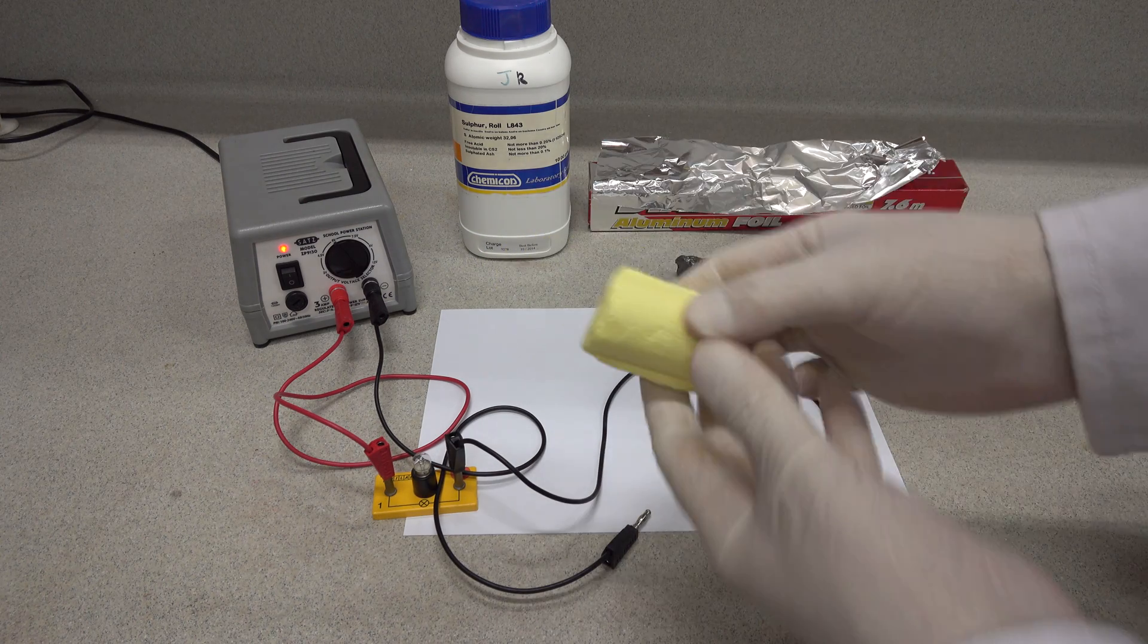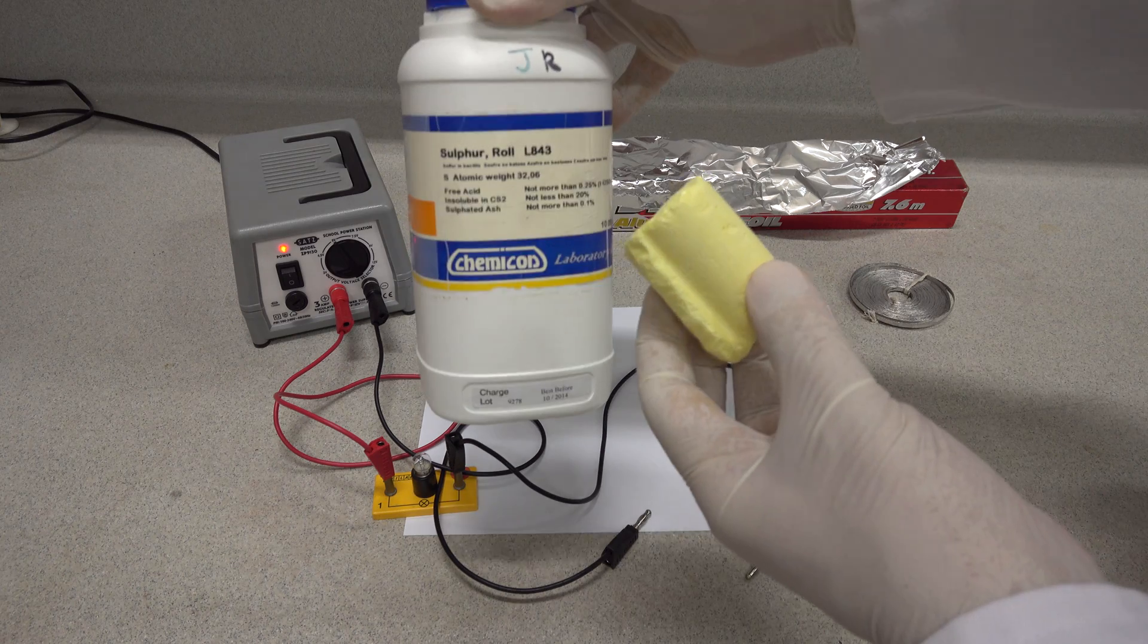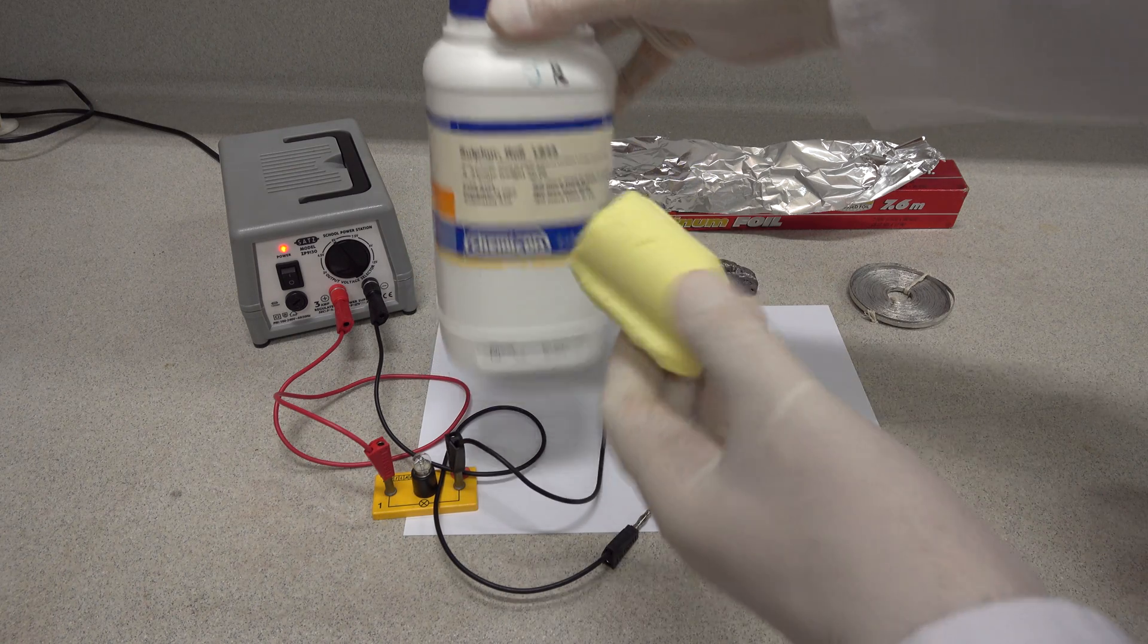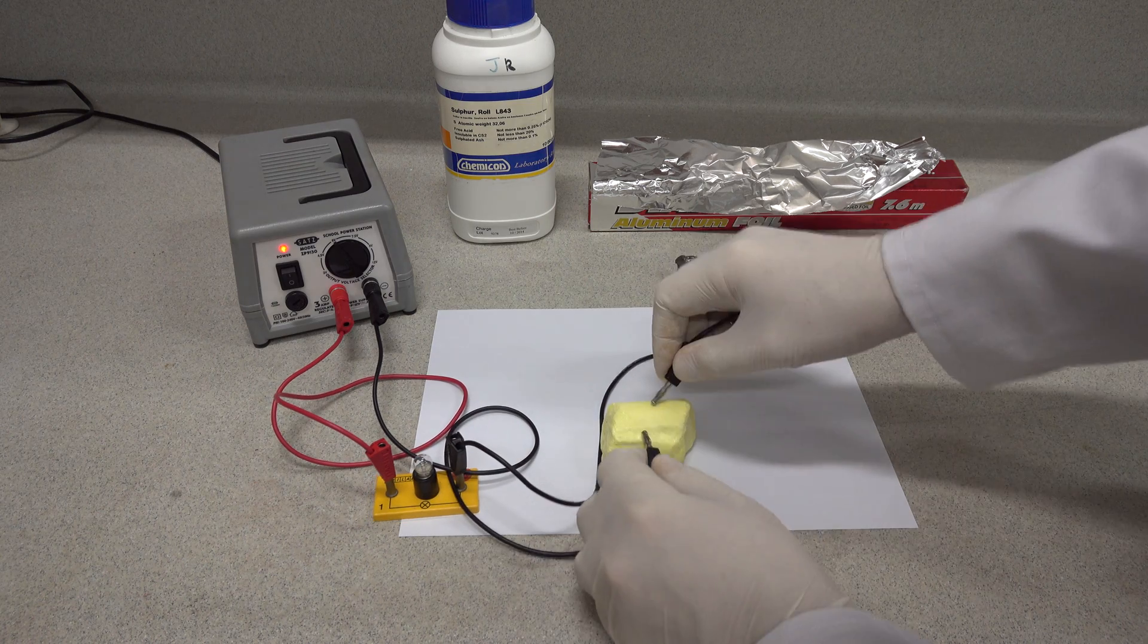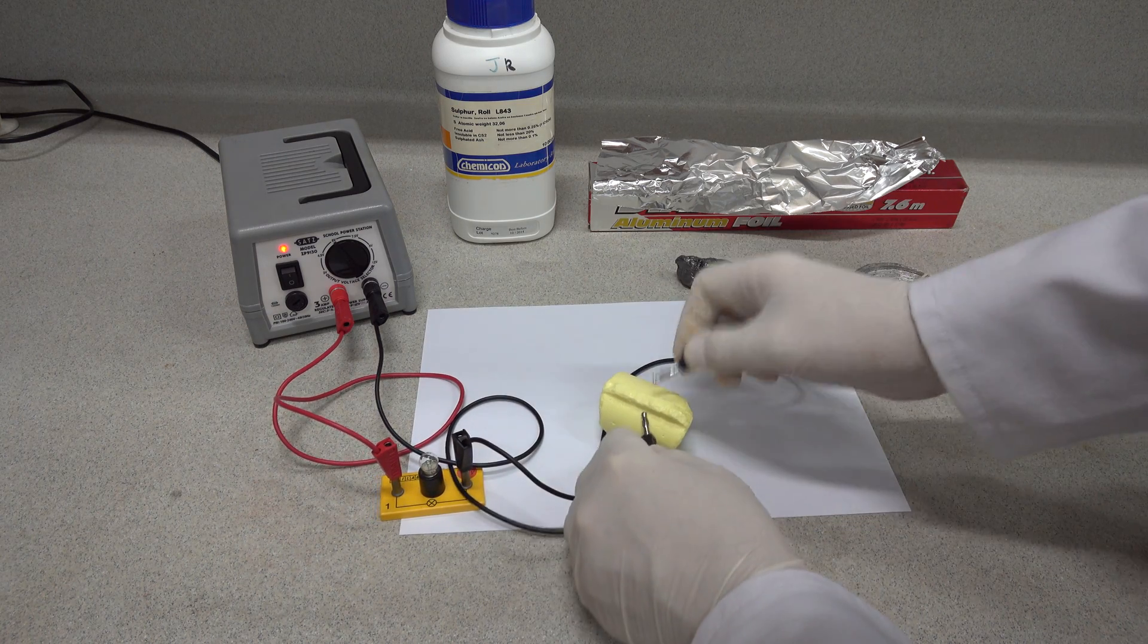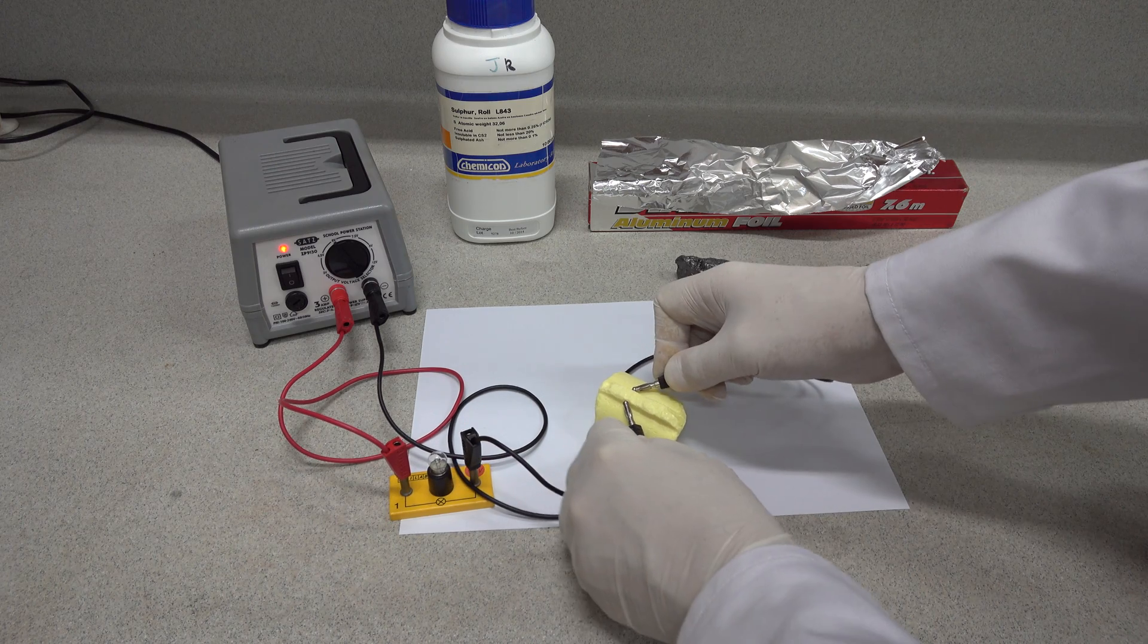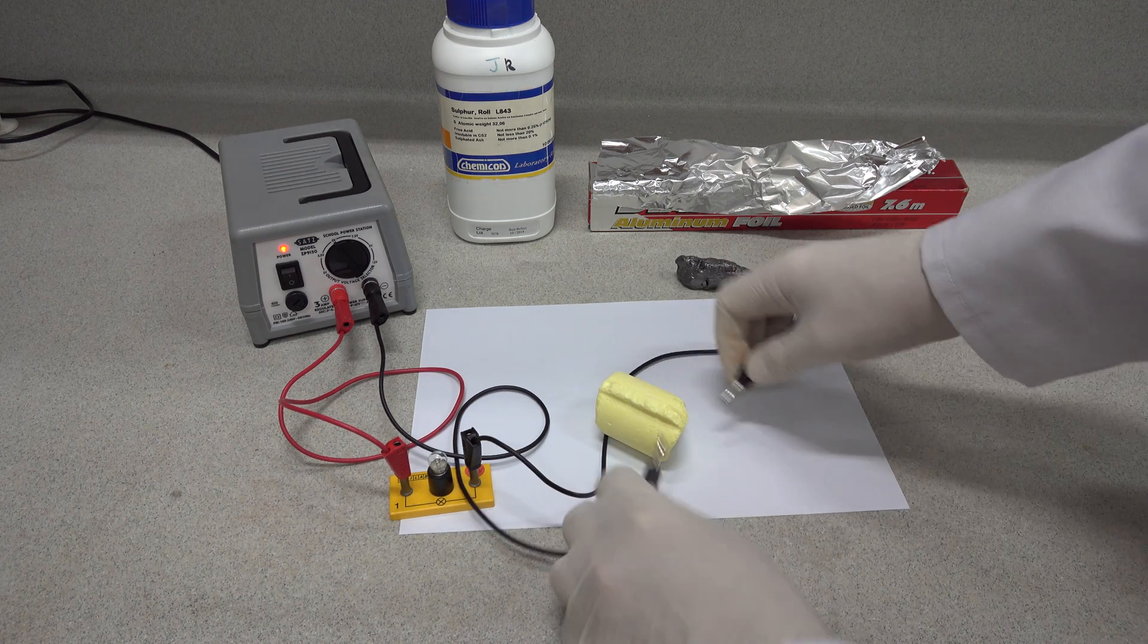So for our first element, that's this bright yellow sulphur here, and let's see if that conducts electricity. You can see if we place the contacts on the sulphur, the bulb does not light.